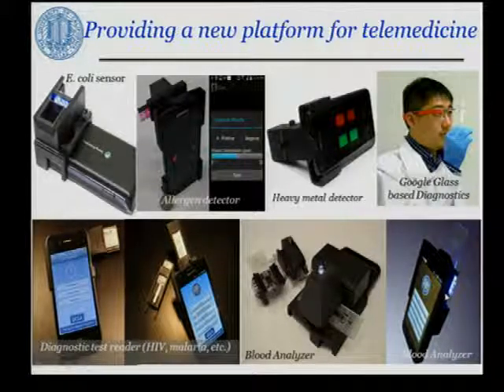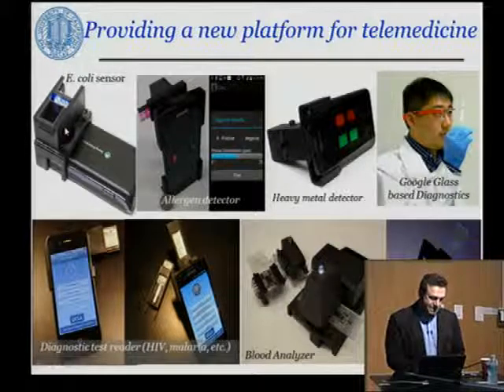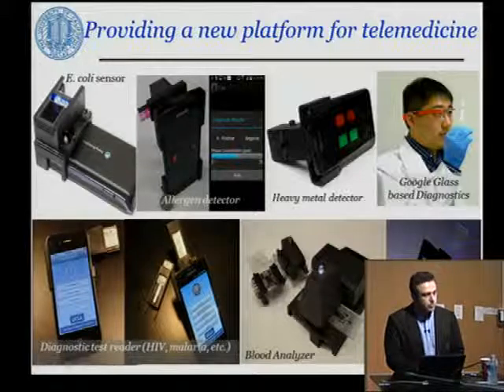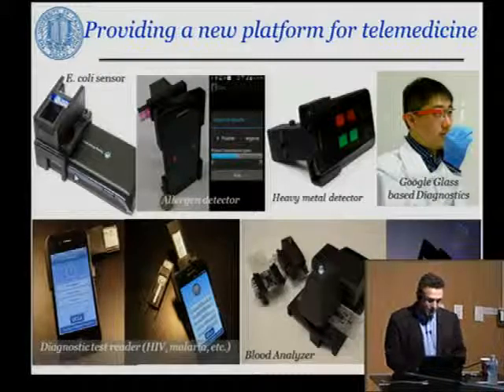You can actually also write an application that will capture and process these images to count red blood cells and white blood cells after some tagging, with about the same level of accuracy that you would expect, maybe 5 to 6% compared to an FDA-approved hematology analyzer for looking at cell count. Some other examples are shown here. You can create all kinds of surface chemistry-enabled sensing platforms where the readout and quantification can be done through a fluorescence interface that is read by a mobile phone.